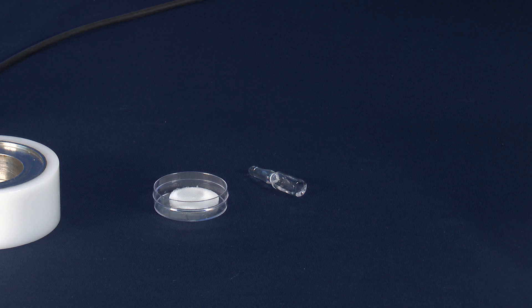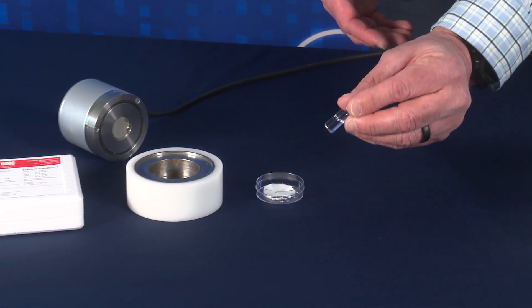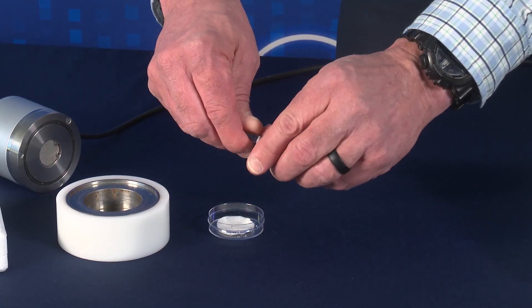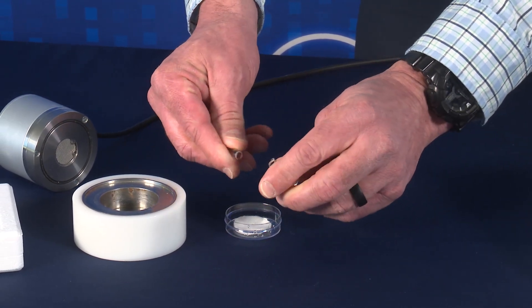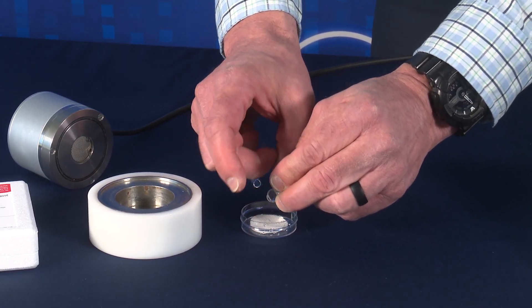The first step is to place a fresh fiber disc pad at the bottom of your 14mm sample cup. These pads are provided with the humidity standard kit. Next, take the glass ampule, tap to ensure the liquid is at the bottom, and carefully break at the perforation and empty the contents onto the fiber disc pad.